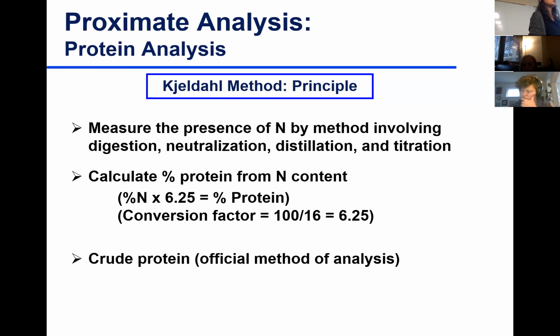So you might have nitrogen sources that are not necessarily coming from your protein. That's why it's a crude protein estimation method. It's an estimation because you're taking all of the percent nitrogen that you're getting, all of the potential amines that you have, and you are saying all of them are proteins. No, not all of them are coming from protein. Okay.